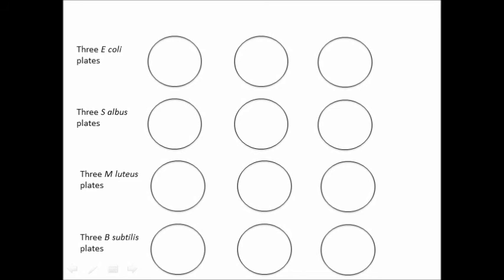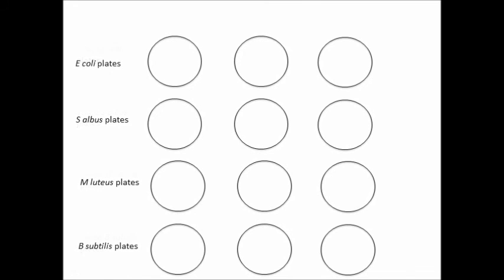Now you need to wait for several minutes until the agar is completely set on the pour plates, or if you used spread plates, until the culture has completely sunk into the agar.